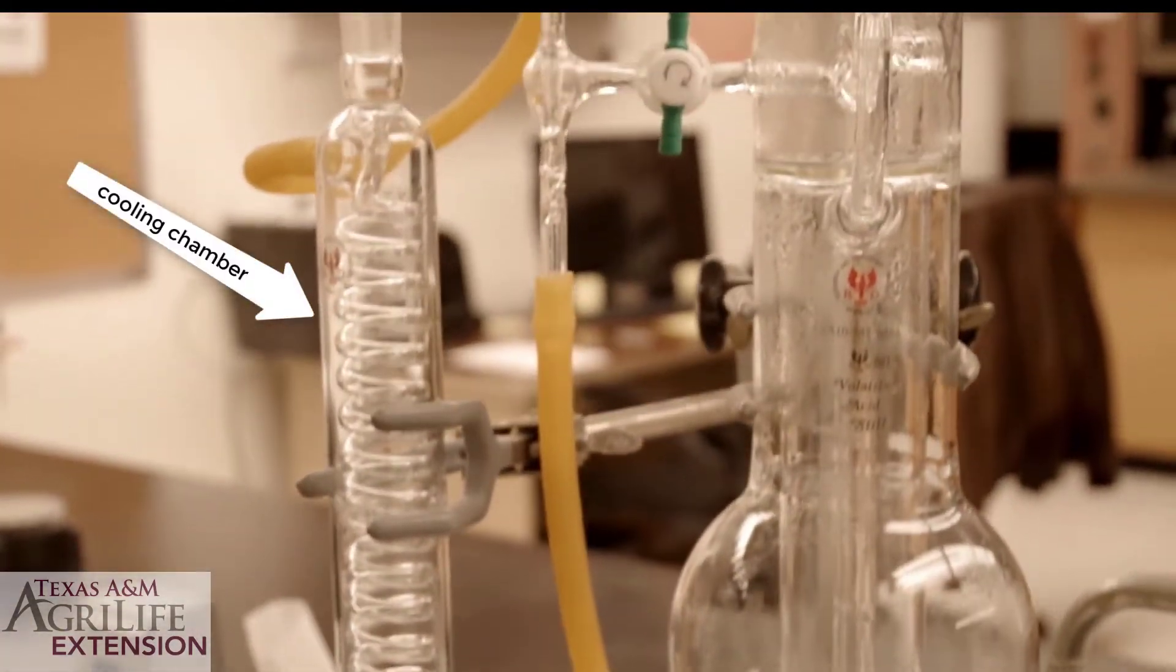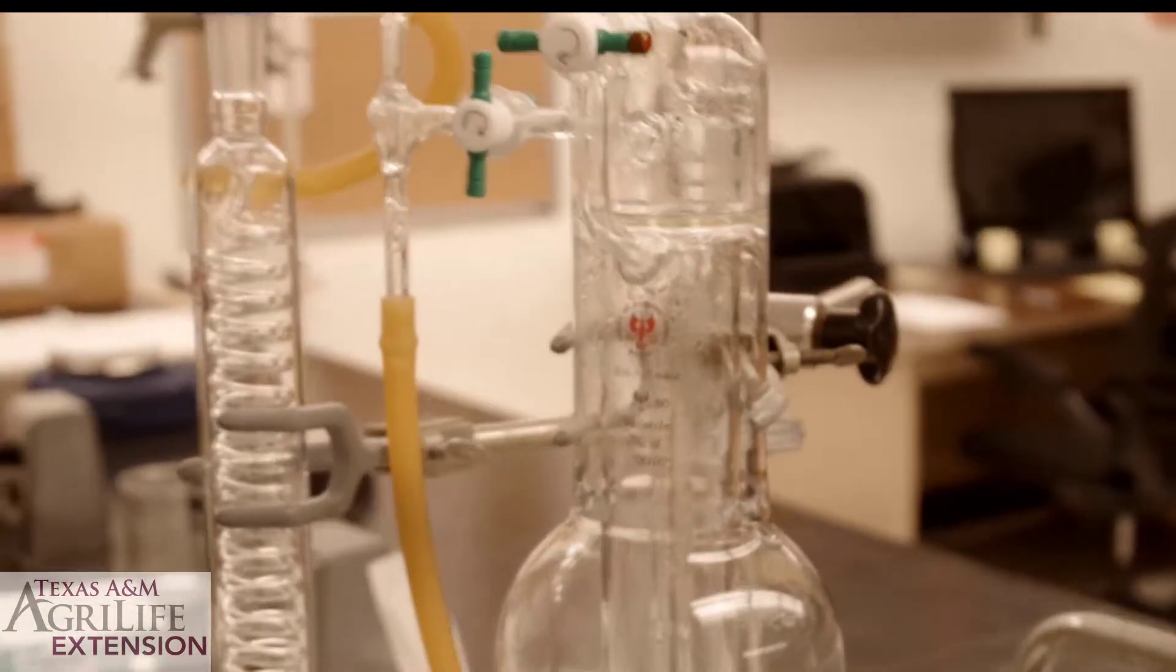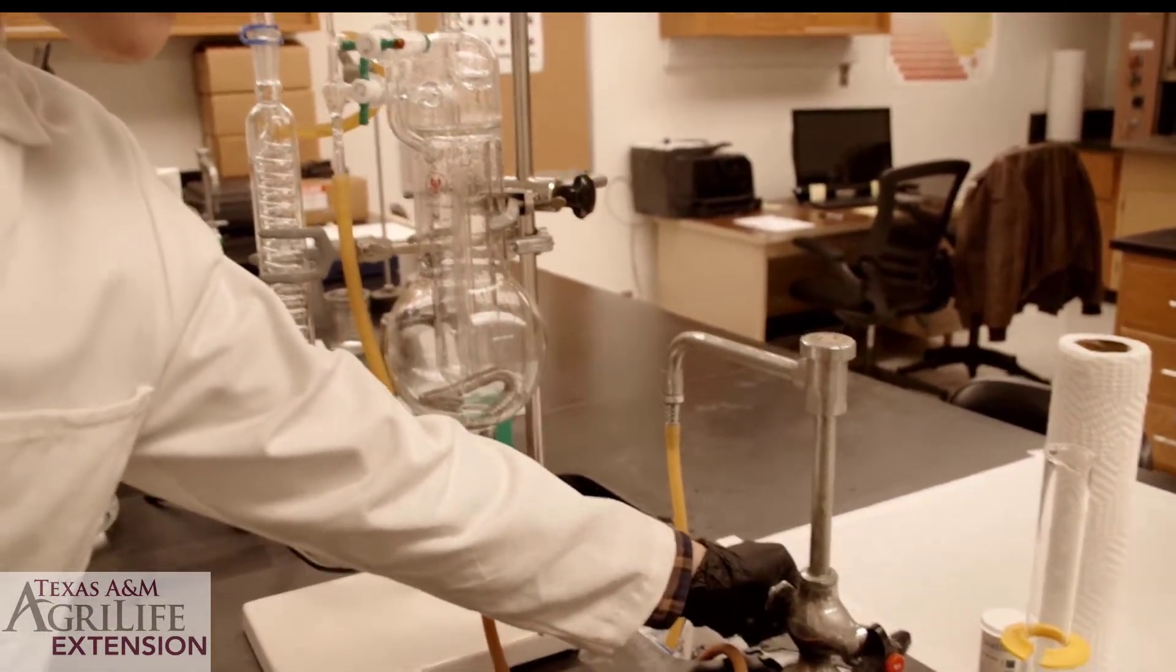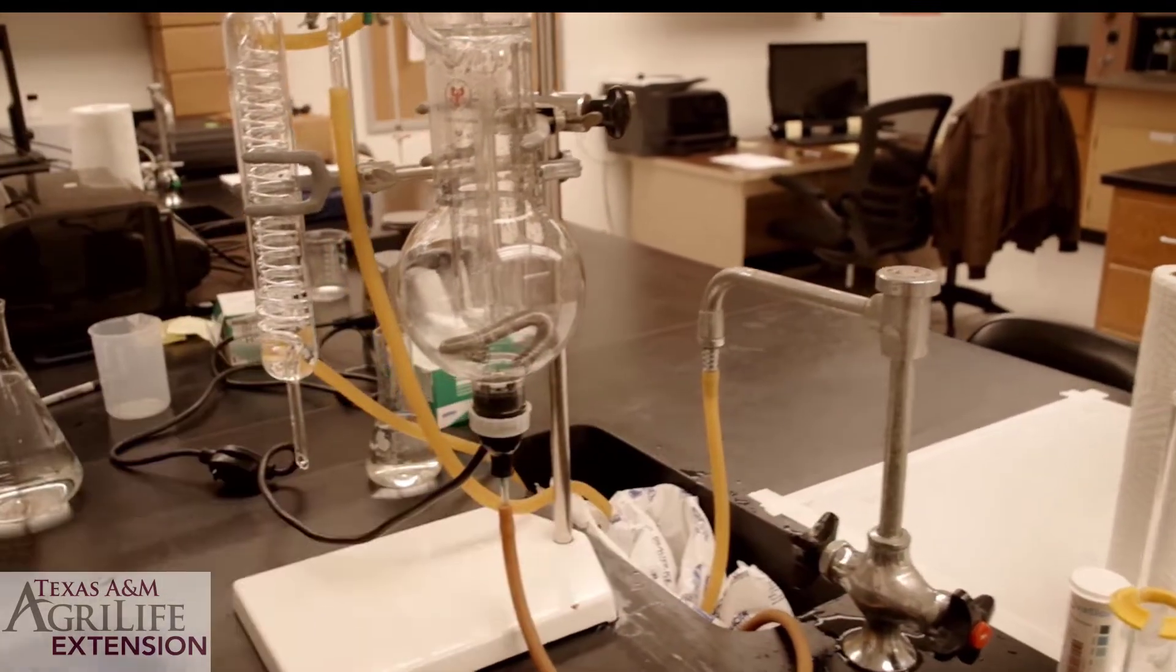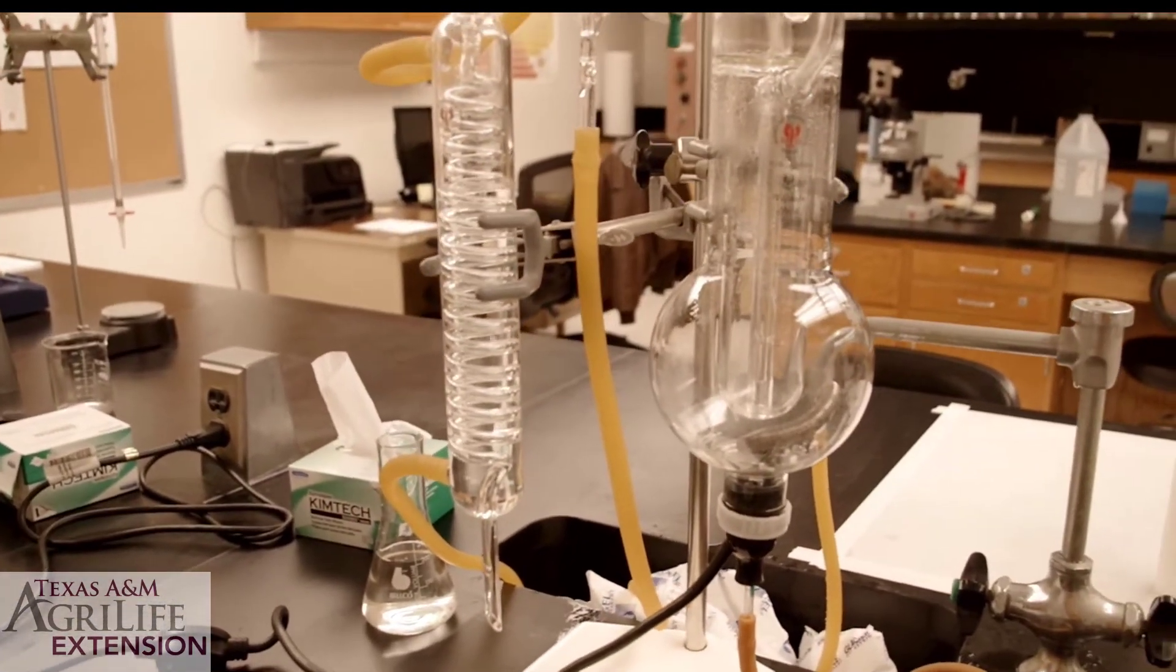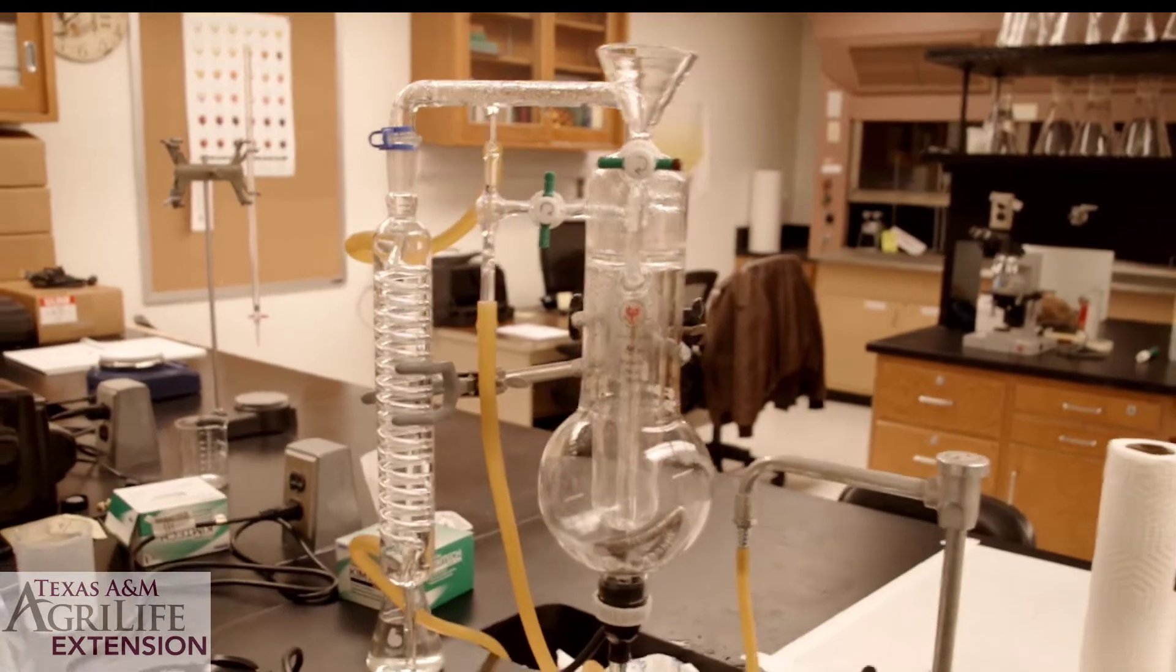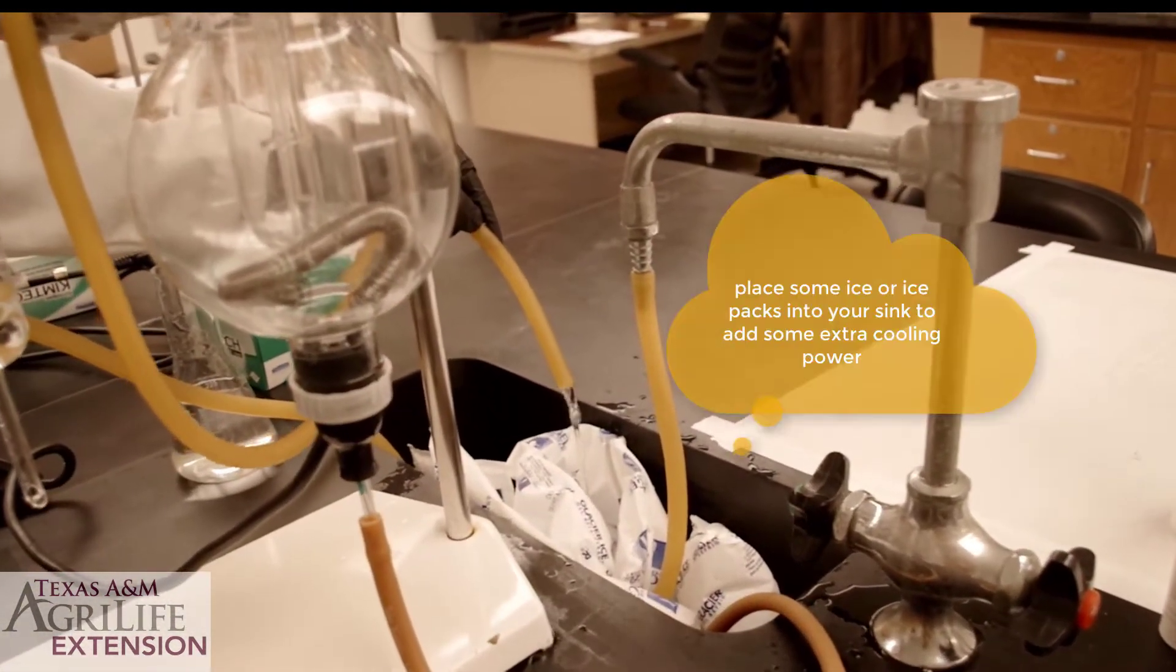On the left we have the cooling chamber. Cold water runs through the cooling chamber in order to condense the volatilized sample traveling through the inner glass coil. Before running samples make sure the cooling chamber has a steady supply of cold water by slowly opening the sink tap connected to your apparatus. Make sure the cooling water evacuates correctly through the middle hose into your sink.